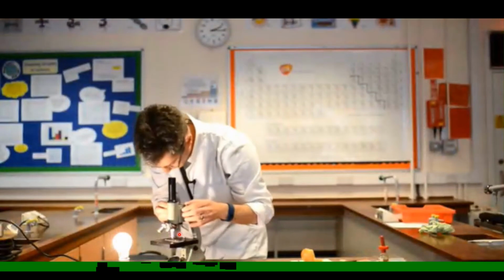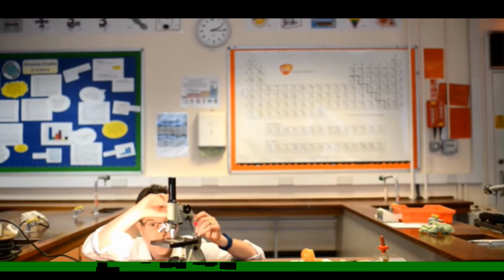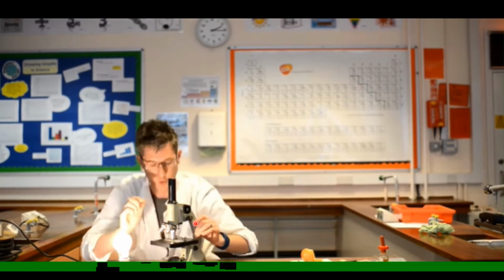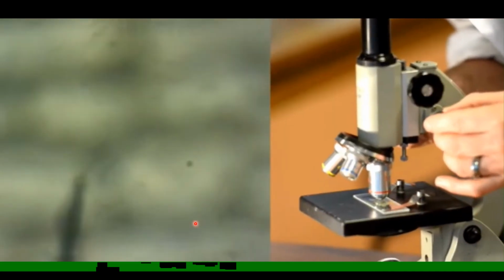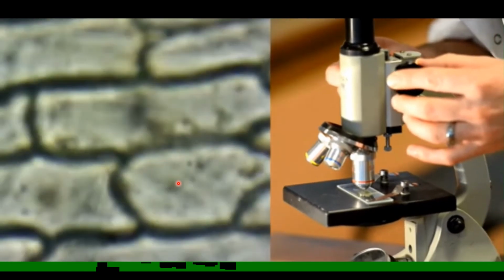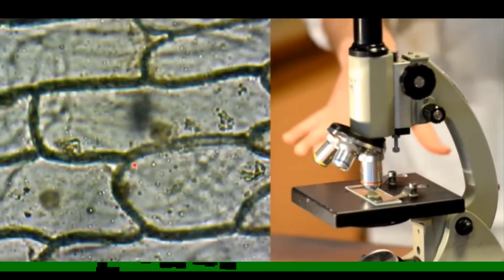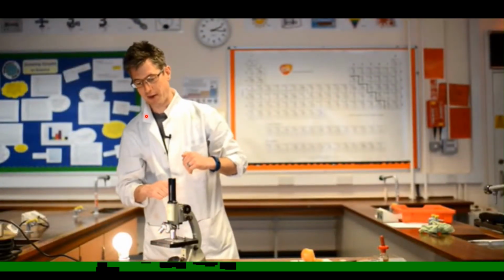So you should be careful in using this high power, and also it is a must to use this fine adjustment knob to adjust the high power lens in observing the specimen. Specimen එක නිරීක්ෂණය කරන high power පාවිච්චි කරනකොට අපි හැම වෙලේම fine adjustment knob එක තමයි පාවිච්චි කරන්නේ. So using the fine adjustment knob you can make the specimen more clearer. ගොඩාක් පැහැදිලි නිදර්ශකයක් අපිට එතකොට high power පාවිච්චි කරලා බලා ගන්න පුළුවන්.